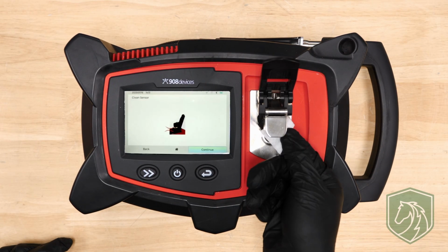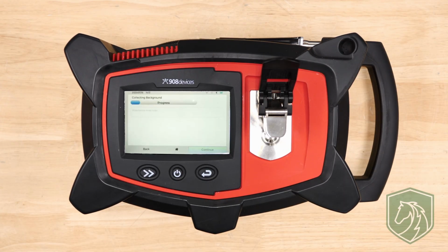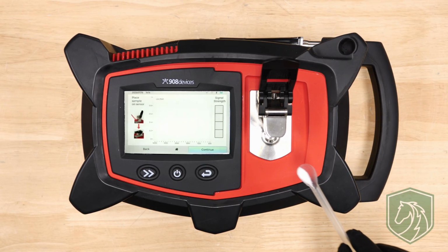Follow the on-screen prompts. Click Continue after cleaning the sampling area to collect the background. The background removes environmental and instrument contribution from our final spectrum.